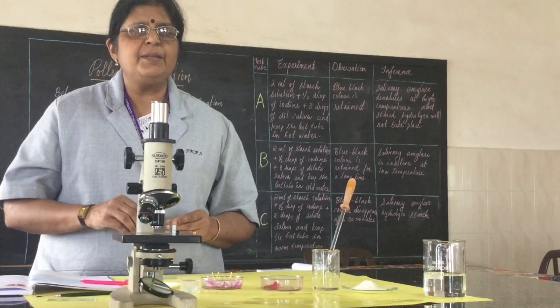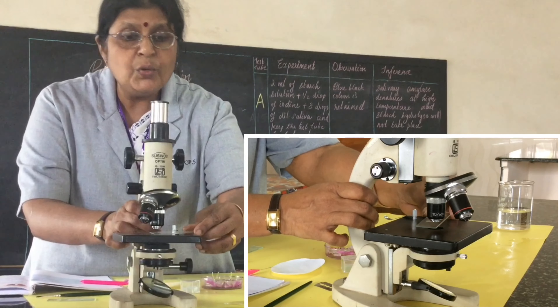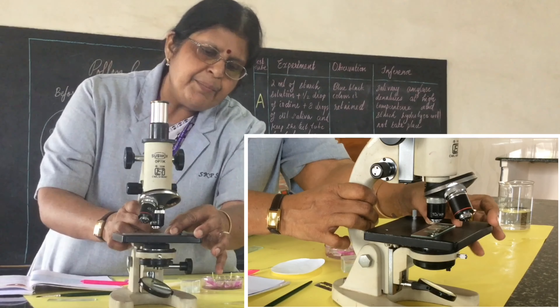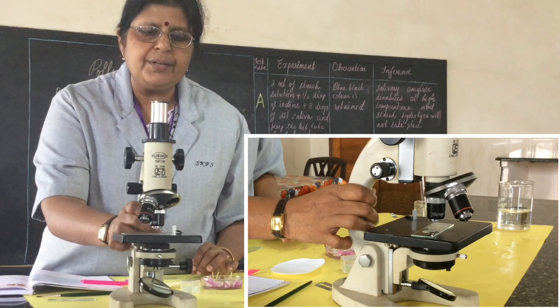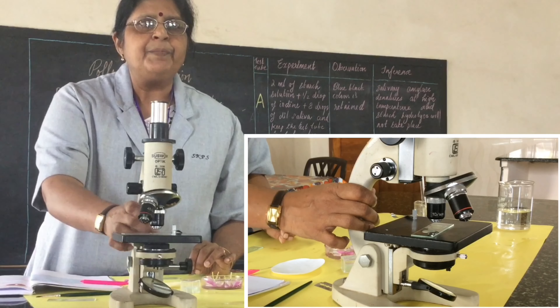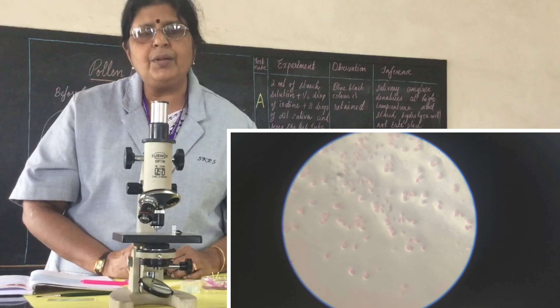After 20 minutes, the pollen grains will start germinating. Take the microscope and adjust to low power. Place your slide beneath the objective lens and, looking through it, adjust until you see the pollen grains with the pollen tube coming out. You can see the pollen tube — it will appear as a faint-colored tube emerging from the pollen grains.